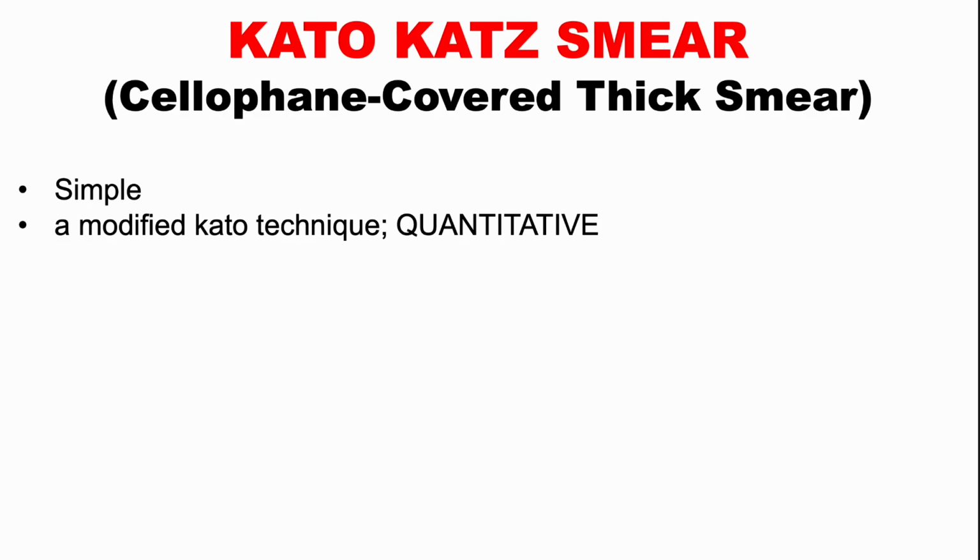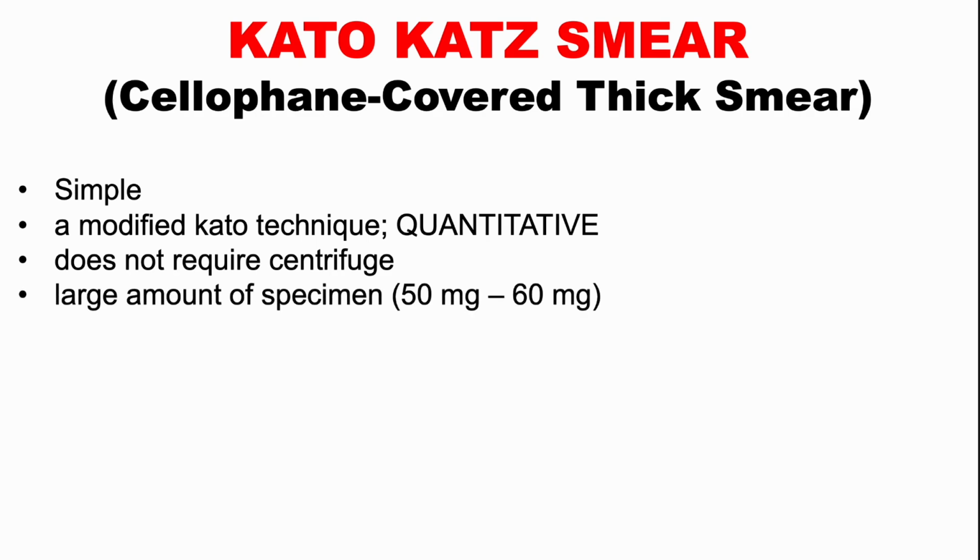And although it is quantitative, it does not require a centrifuge, unlike the concentration methods like the FECT or the sugar flotation technique. Those procedures require a centrifuge for concentration.